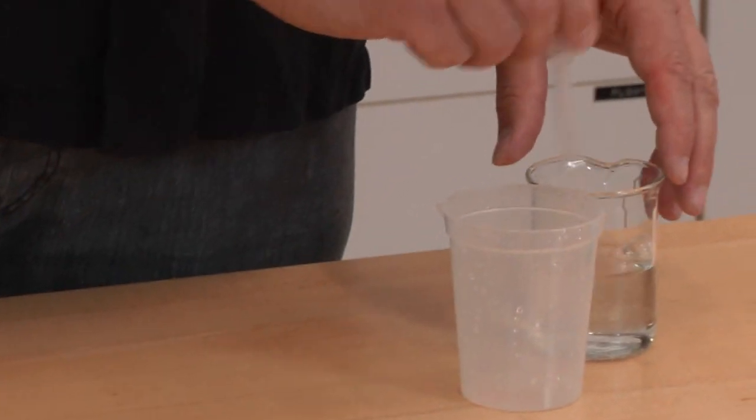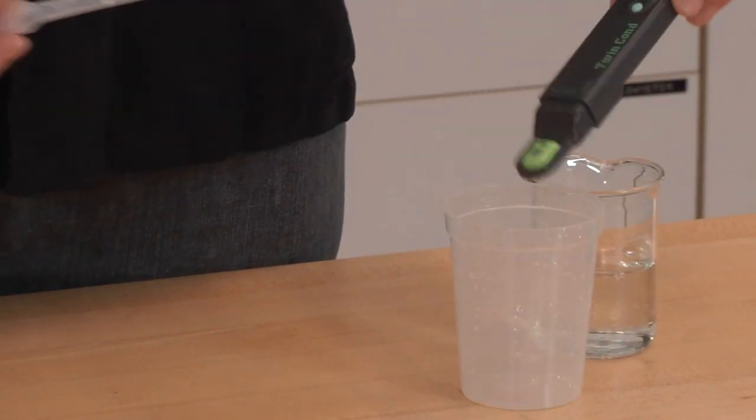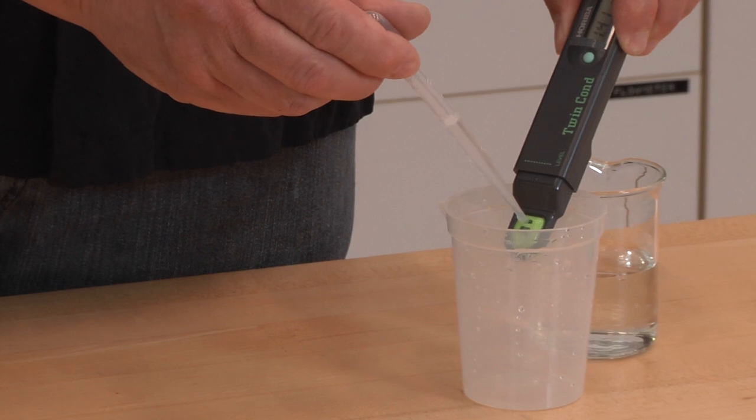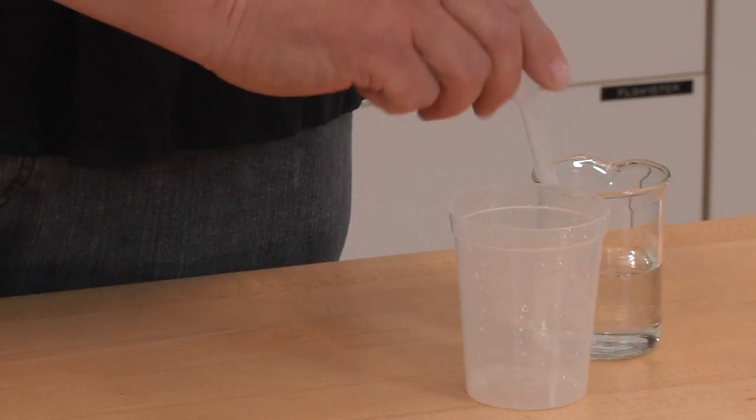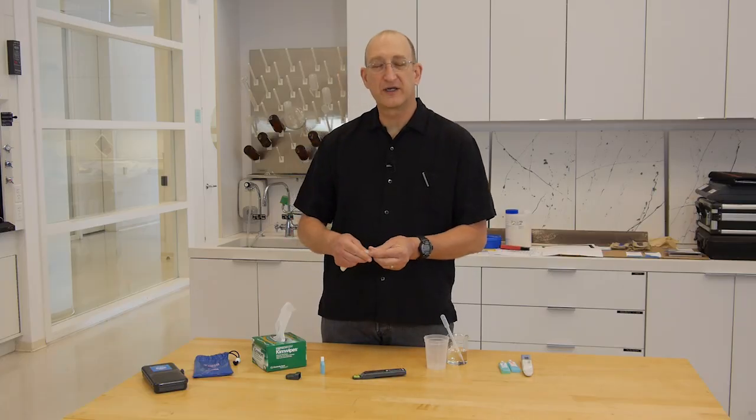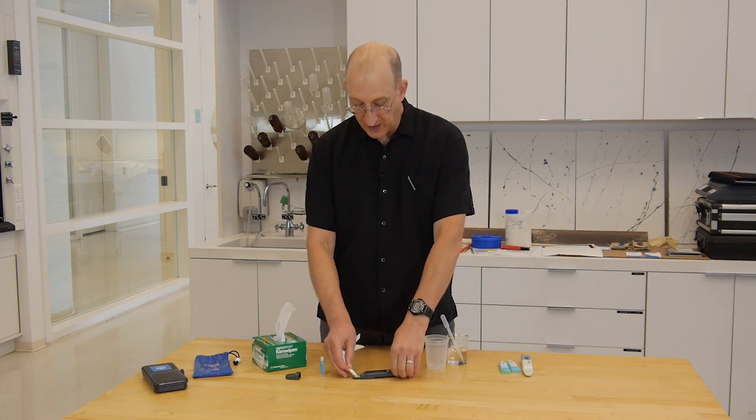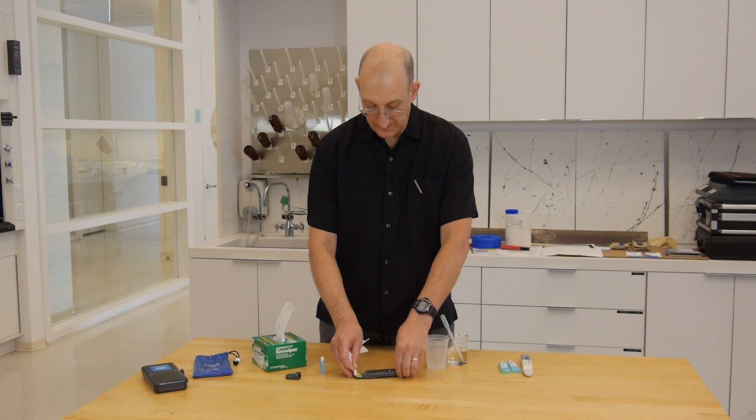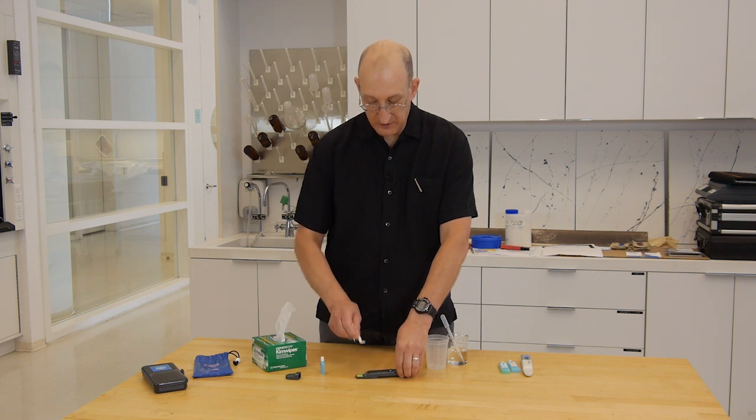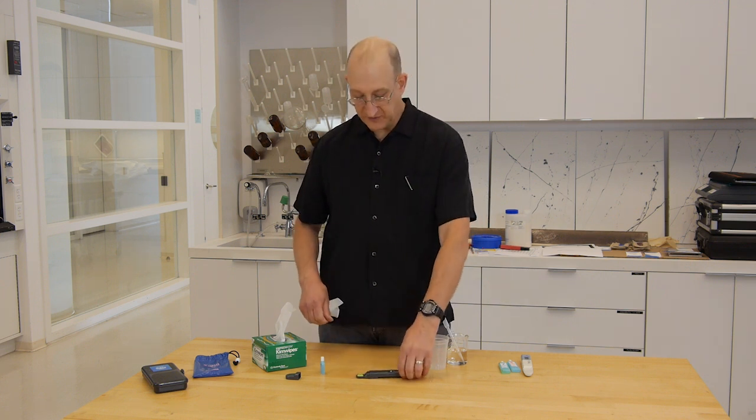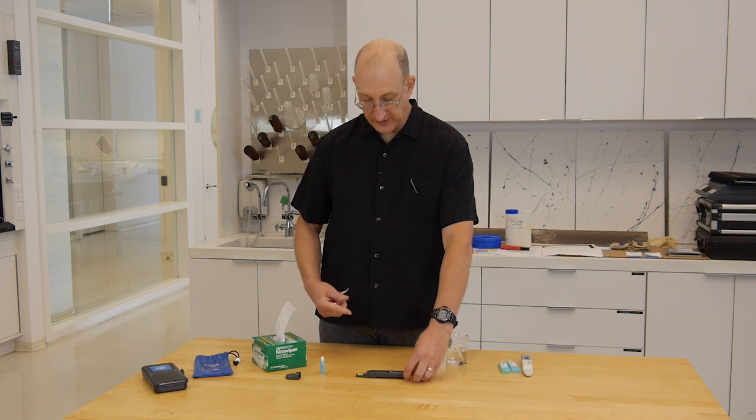We then rinse the electrode head with deionized or distilled water and flush it out. Because dilution matters for conductivity meters, we want to make sure we always dry the sample well with a little piece of kimwipe to get the water out, so we don't dilute our next reading.